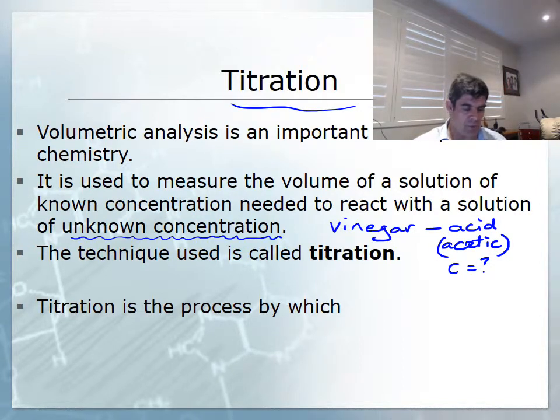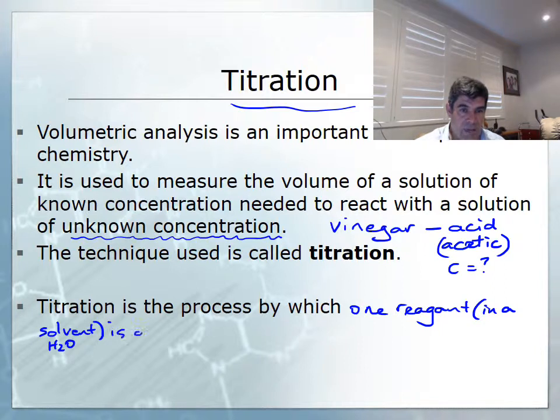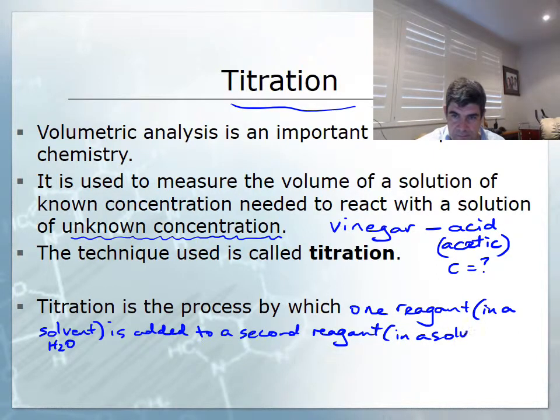Effectively, when we're looking at titration, what we're looking at is the process by which one reagent, which is dissolved in a solvent, for our purposes the solvent would be water, is added to a second reagent, and this one is also in a solvent, again most likely H2O, from a burette.